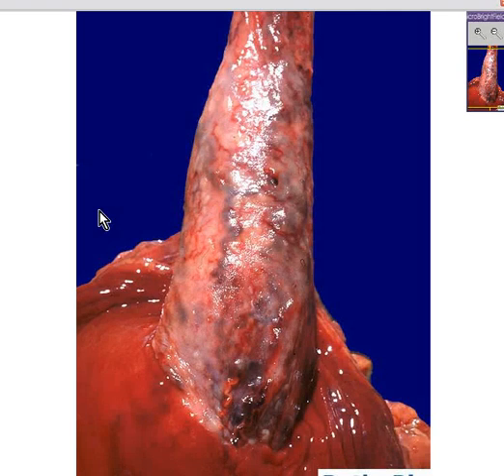Here's an interesting case. You're not likely to see too many gross specimens like this. This is an esophagus, and this is a stomach, but it's turned inside out. So what you're actually seeing here is the mucosa of the esophagus and the mucosa of the stomach. Notice the stomach has this red mucousy type of mucosa, and notice that the mucosa of the esophagus has these large veins, very squiggly, some bulging quite a bit over here as well.